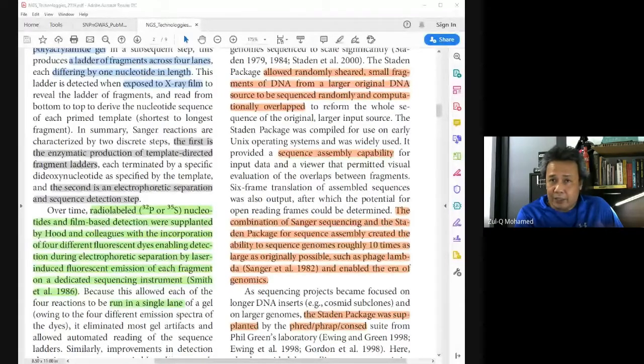But later this was replaced by fluorescence. Until now, sequencing has been using fluorescent labels and not radioactive, although I know for a fact that some labs still do sequencing using 32P.